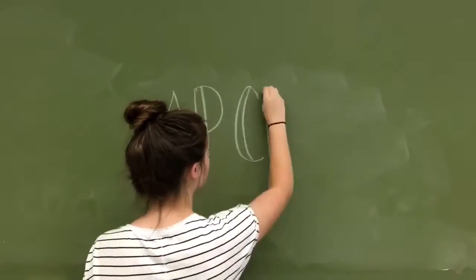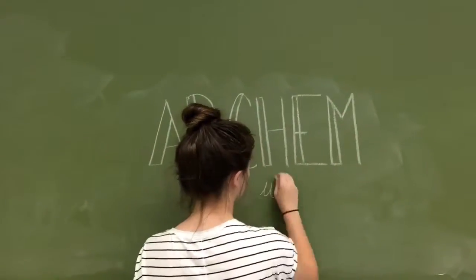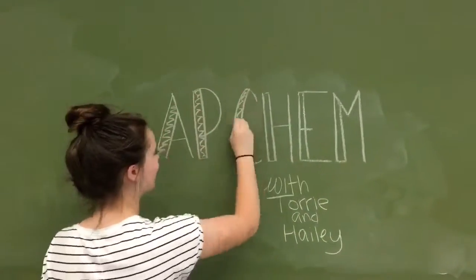Welcome to AP Chem with Torrie and Hailey. Today we'll be demonstrating instant fire with sulfuric acid, sucrose, and potassium chlorate.